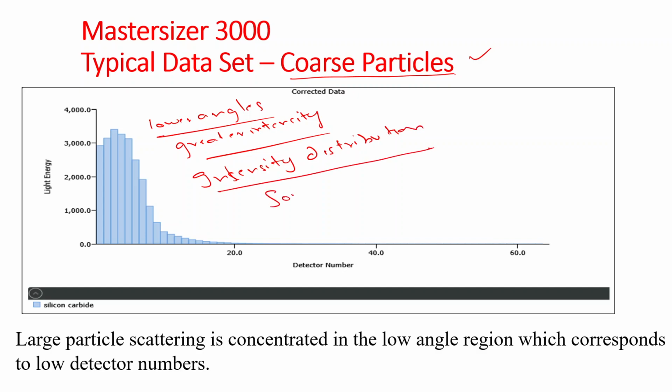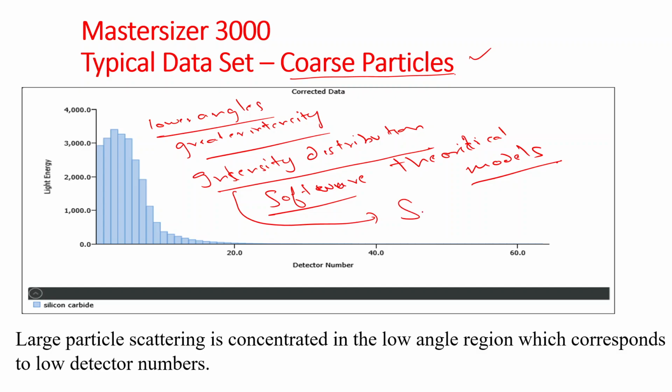This intensity distribution will be compared with the theoretical models which are in the software, and this intensity distribution curve will be converted to a size distribution curve, the size distribution pattern.